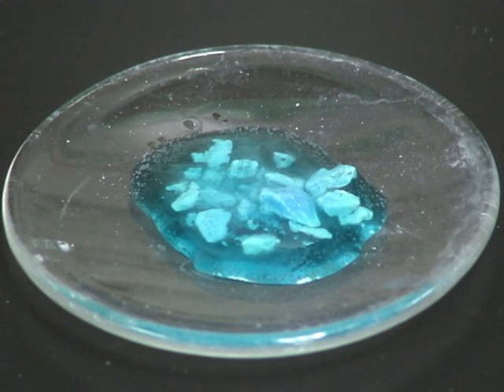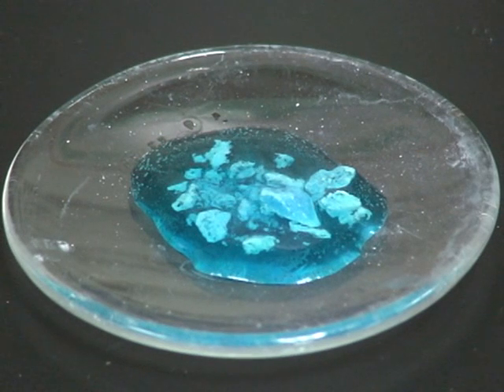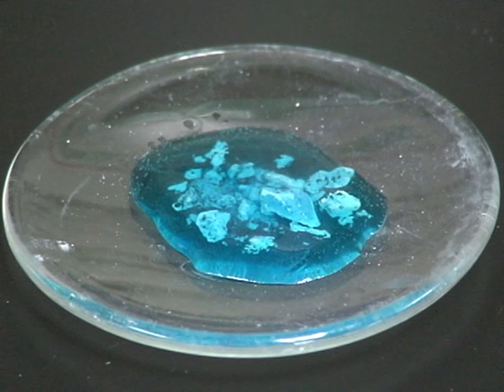What I did is I added water, and you notice that it turned blue again. That was the original color. And if we let that sit out, that will crystallize, and the whole thing will become crystals again. But because it returned to its original color, that shows it was just a physical change, not a chemical change. Color then can indicate either a chemical change or a physical change.